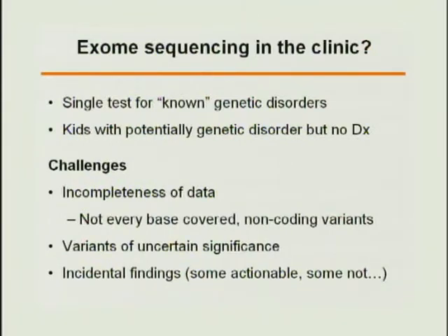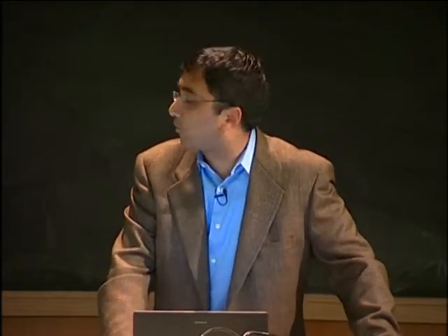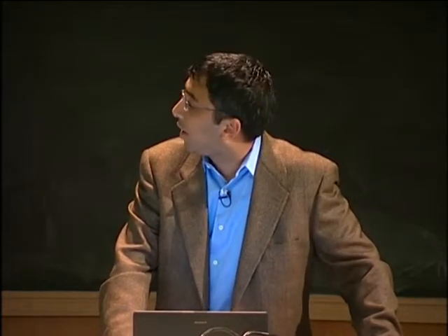So some challenges, I think, include the incompleteness of the data. We were very proud of our 96%. In talking to people in medical genetics who are focused on resequencing of particular genes, they often want 99.9%. And that's using next-gen technologies, that can be challenging, and I think that's something that needs to be thought about.